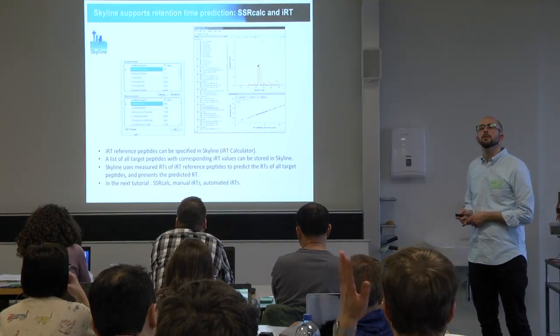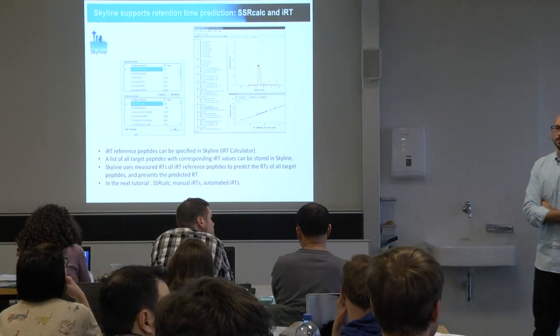Any more questions? Yes? I would like to ask about chromatography. For shotgun, typically one tries to aim for the best resolution possible, and it seems that's not the case for the targeted SRM experiments.